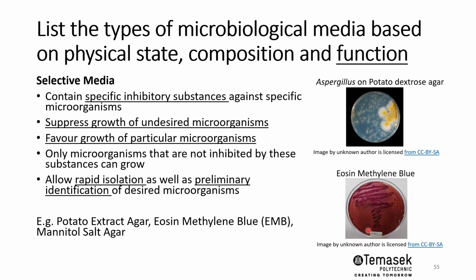In contrast, non-fecal bacteria ferment lactose much slower and produce a smaller amount of acid relative to the fecal bacteria, which can produce a large amount of acid upon fermenting lactose as a carbon source. In the end, the non-fecal bacteria produce a small amount of acid and hence their colonies are of a different color. They may appear brown or pink, as you see in the image here, relative to microorganisms such as the gram-negative fecal bacteria that produce a dark purple or metallic green color.